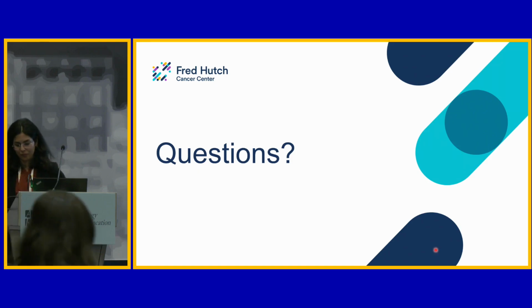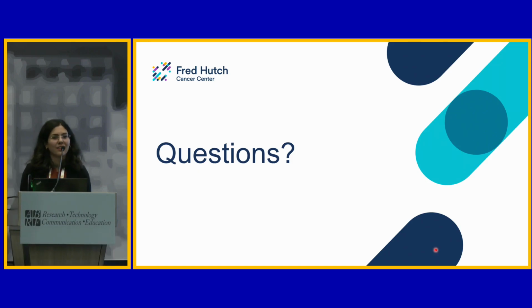Thank you. Hi, thank you for that. I'm interested because we're running the same comparison. And you didn't show any image because, well, let's just talk about N. This is an experiment run twice. We have the same N, so we're not willing to make any conclusions based on 2 runs.